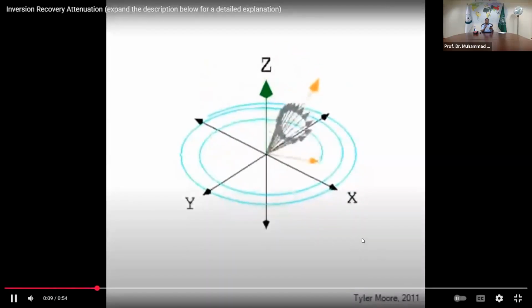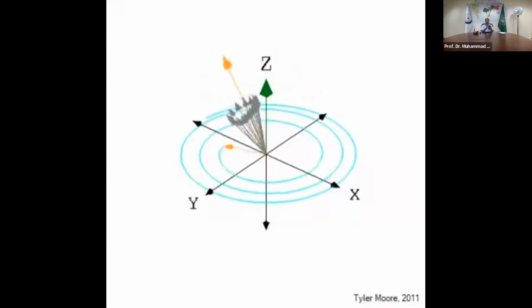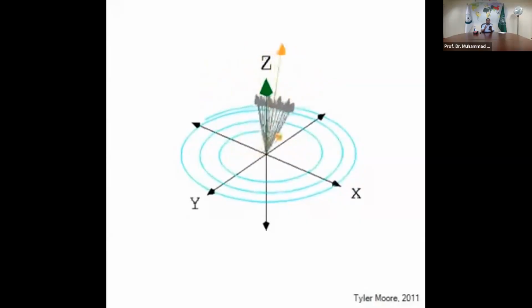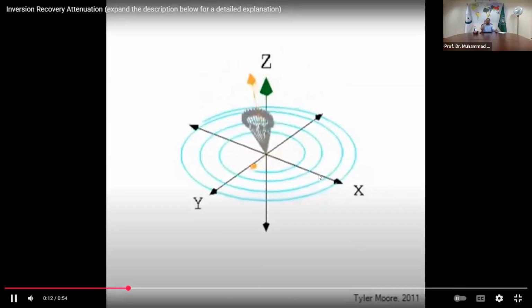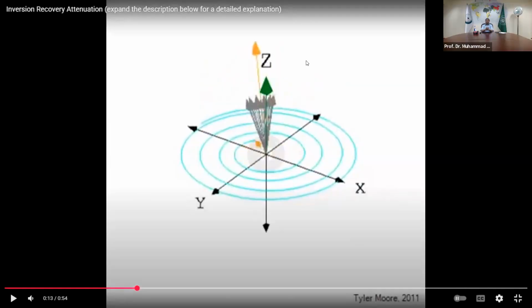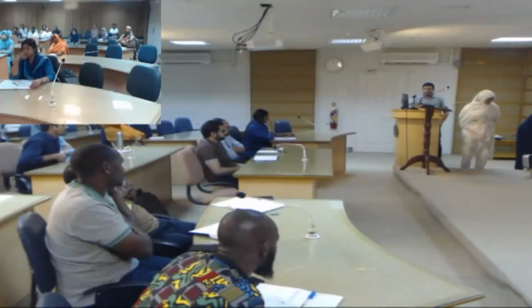Now my colleagues will explain to you about the probes, and the probe which they have in front of you is generally in the range of about 100,000 USD. So the one which you will see in front of you is about $100,000. We are showing a probe for 500 megahertz.